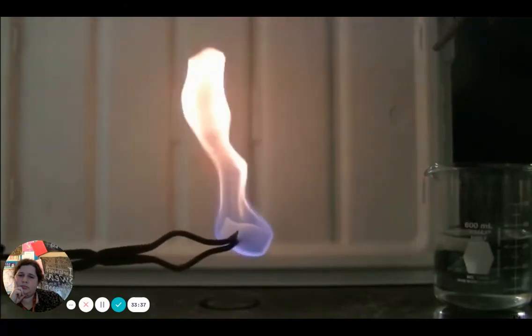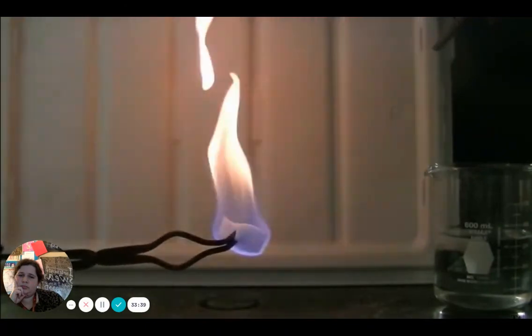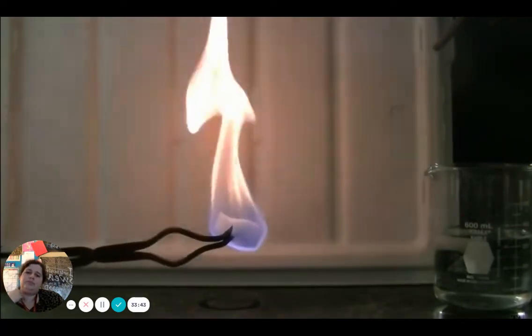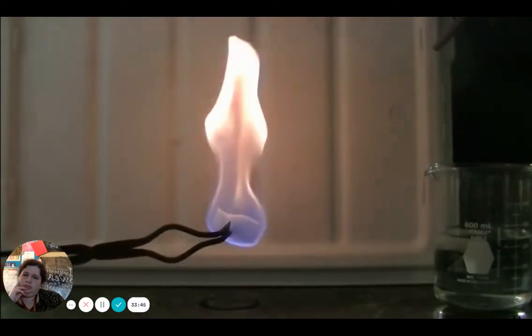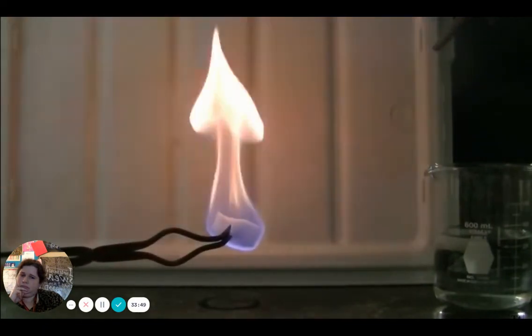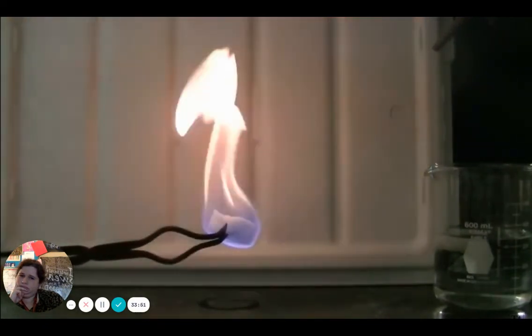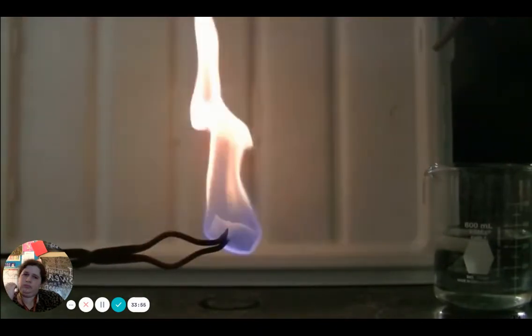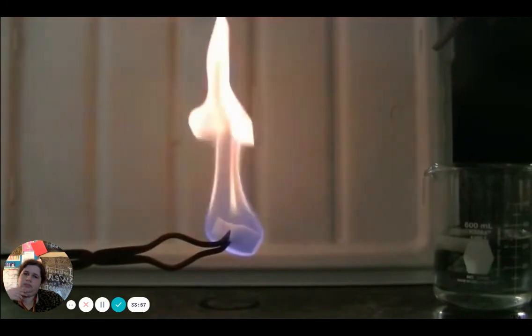But if you look down near the bottom of the flame, right around the sponge, you'll notice that the flame is blue. So at the bottom, when the fuel is first burning, it's burning completely. But as the flame rises, it gets a little oxygen deficient, and it's a little more difficult for the fuel to combust completely.